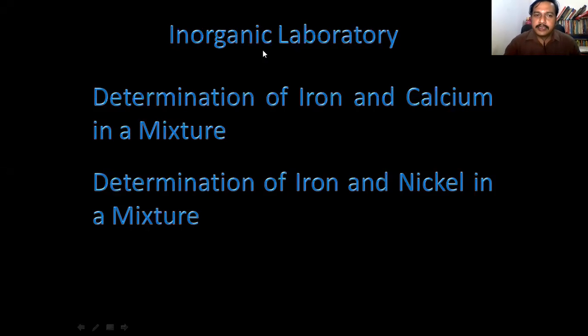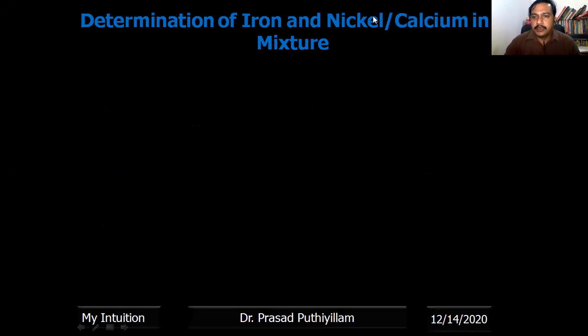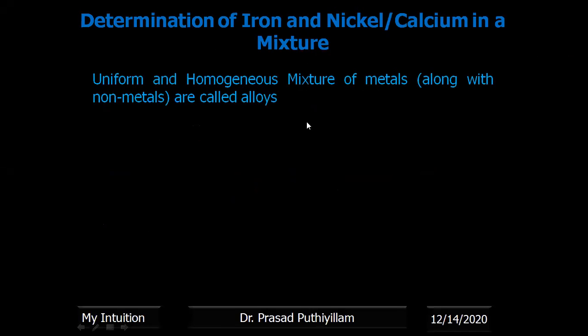In this class, I am explaining the inorganic laboratory determination of an iron and calcium mixture, or the determination of iron and nickel in a mixture. Both can be explained in a single video. That's why I made it like that. It is a mixture of iron and nickel or a mixture of iron and calcium.